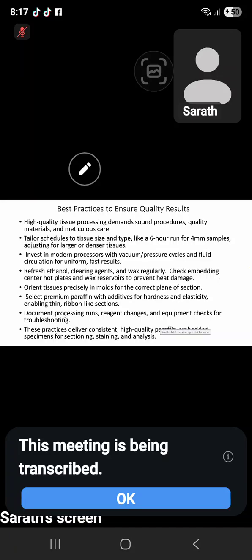Then document the process. Everything should be documented. All the steps should be documented. That's compulsory: reagent changes, equipment checks, troubleshooting. Those things are very important for troubleshooting. Each and every step should be documented in the laboratory. It's very, very important for the day-to-day functioning and correct running.